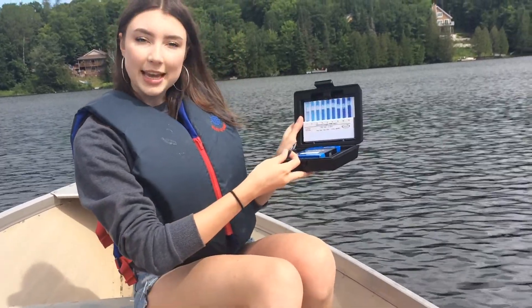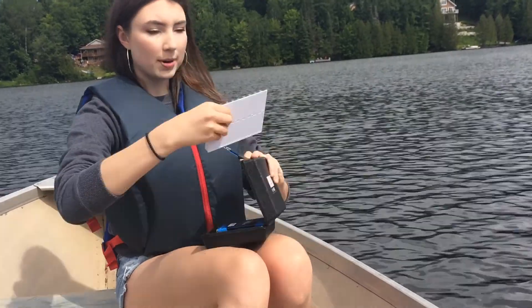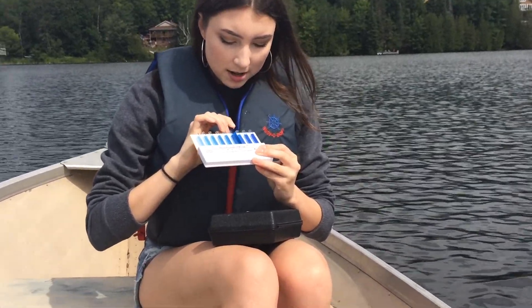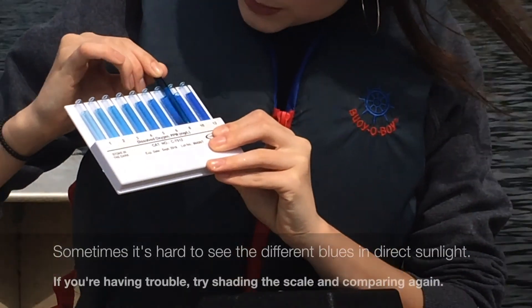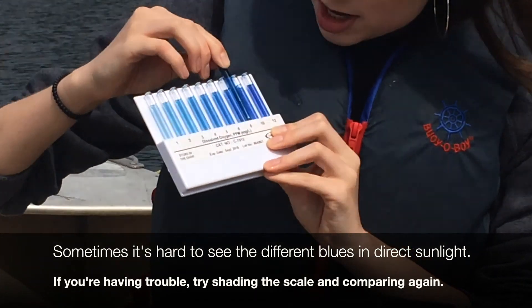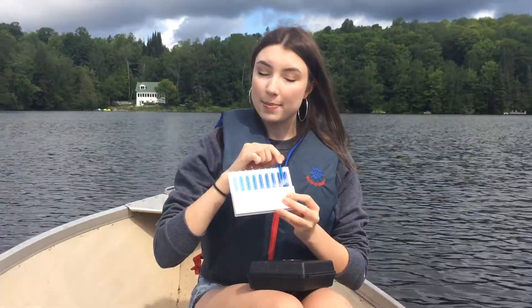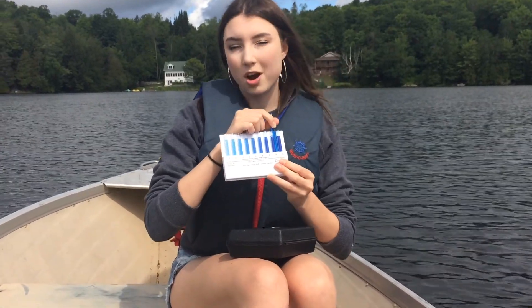To get this scale out, it's a little bit tricky, but all you have to do is pull from the top and it should pop right out. The way that I like to compare this is to hold the ampoule between the ampoules on the scale — this way you're able to get the most accurate side-to-side comparison. You can move it back and forth and see where you think it fits best. For this one, it fits best between the 10 and the 12, and you are able to take the halfway point. So for this sample, I would say that it contains 11 parts per million oxygen.